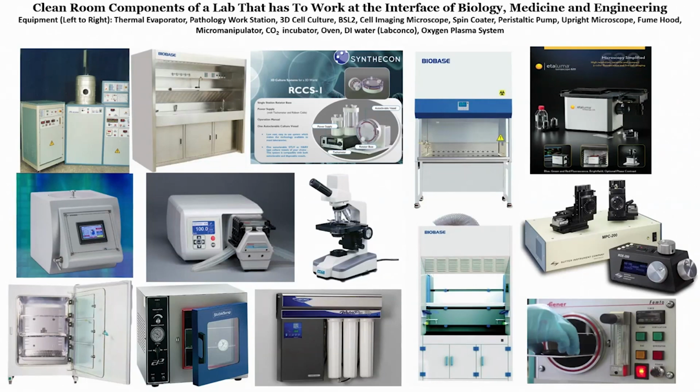There will be an imaging microscope, there can be a spin coater, a peristaltic pump, an upright microscope, or metallurgical microscope, a biosafety hood you can see here, right. You can see a fume hood here, you can see a micro manipulator here, you can see an incubator or an oven, right, a DI plant, an oxygen plasma system.